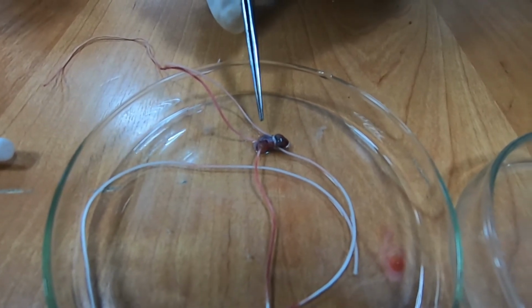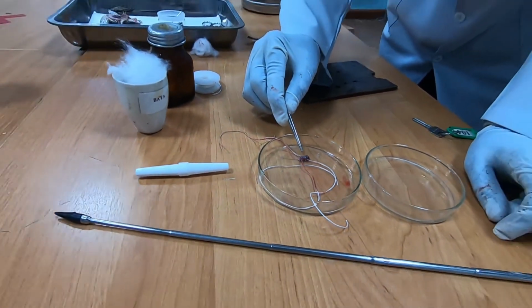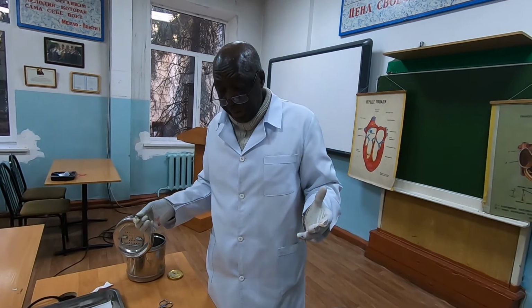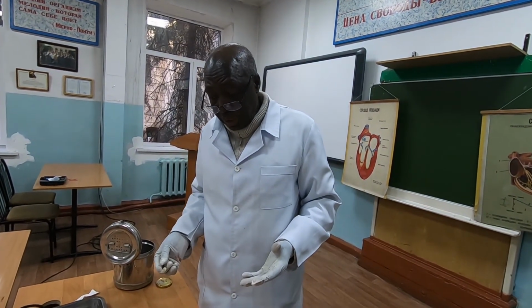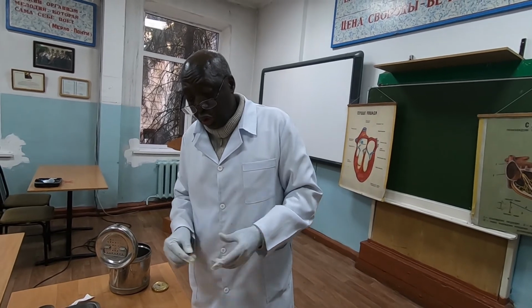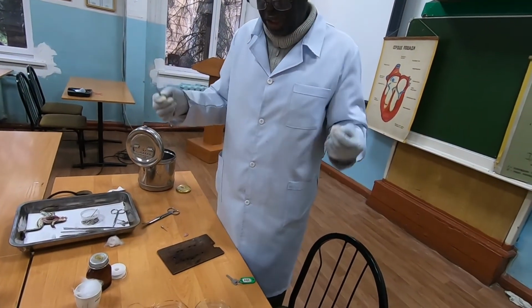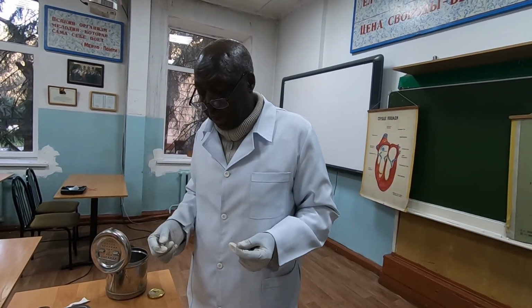That's it, dear students. This is to show you how our hearts work. Our heart works automatically. So thank you very much for your attention. I hope you have got some little knowledge about how our hearts work. Individual hearts work automatically, even when taken out of the body, because the source of its energy is inside the heart itself.